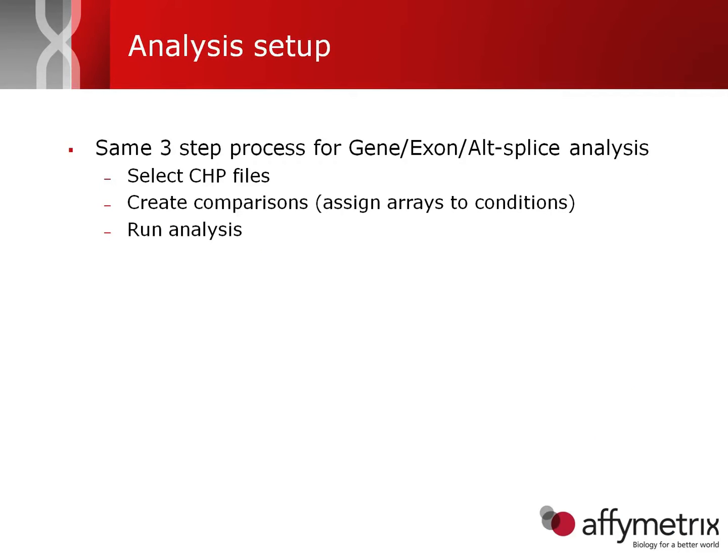The first thing to note is that the same three-step process is used for the gene, the exon, and the alternative splicing analysis. The first step is to select the chip files you're interested in, which are the output of the Expression Console signal summarization.